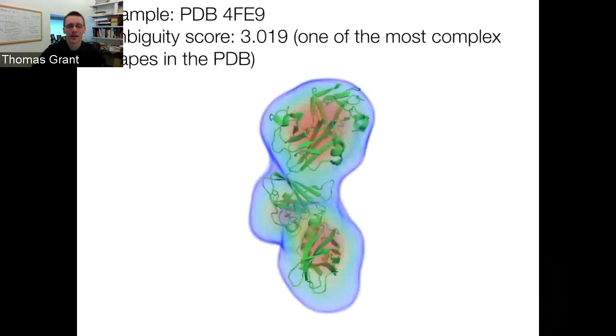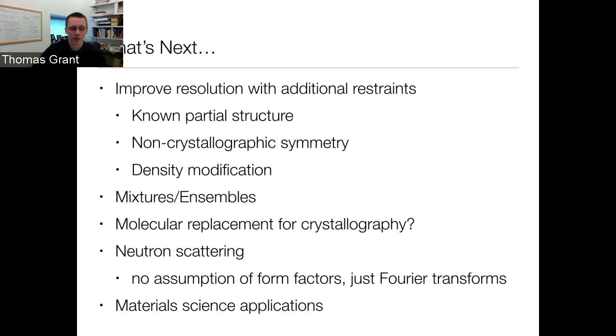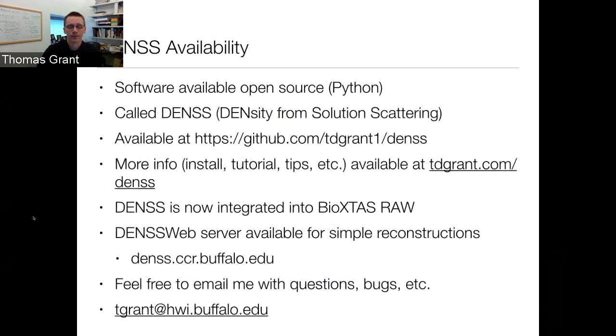And it turns out to be really powerful. If you go back to this guy here, so this is without any symmetry. If you apply fivefold symmetry to this, it does a very good job of actually reconstructing the little ring in the center, and then these 5 arms on either side. And so it does a very good job to impose the extra symmetry. And then there's a series of other features that we hope to be able to add.